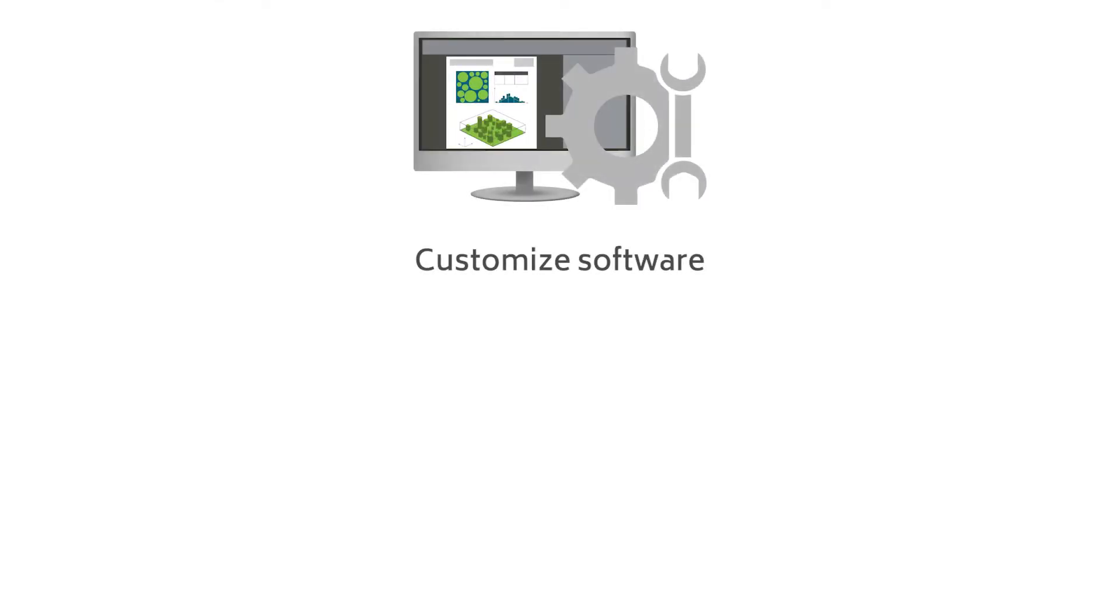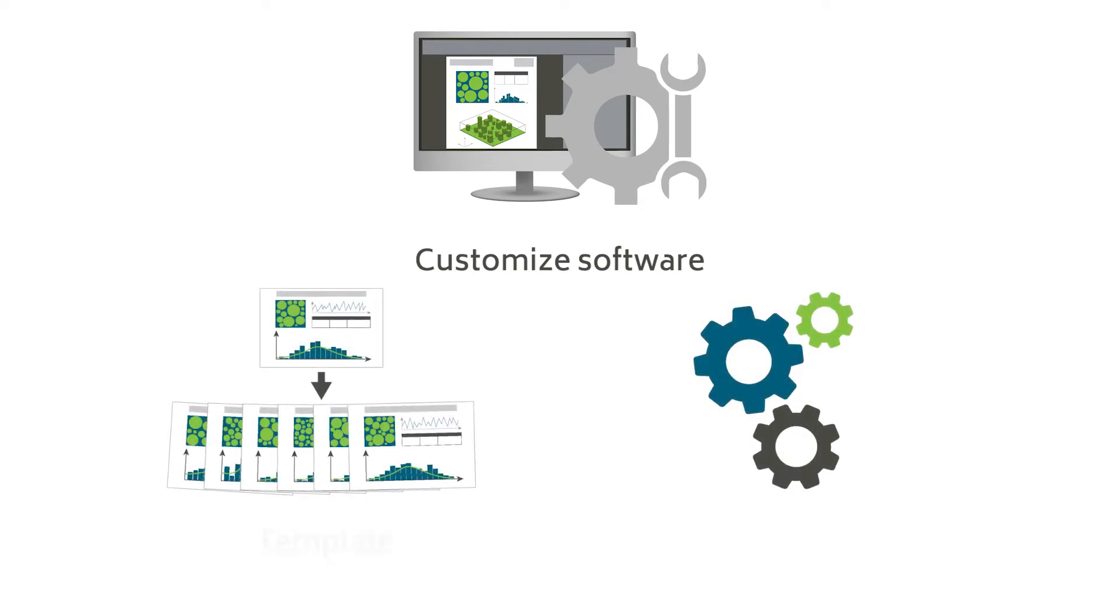These include options for customizing the software interface. We'll also have a look at some of the powerful automation tools available such as templates and mini-docs.